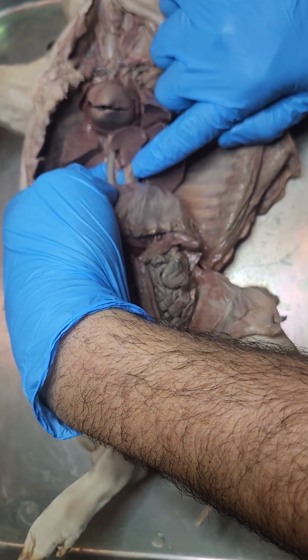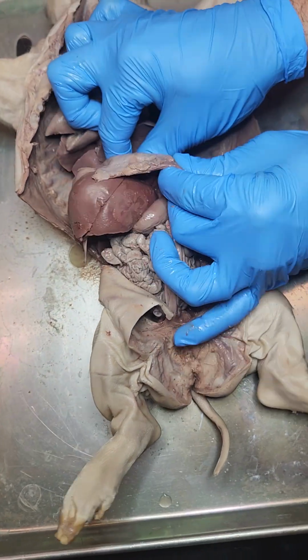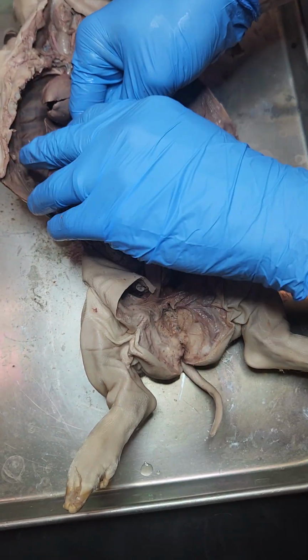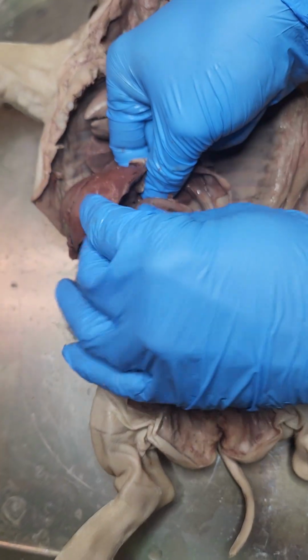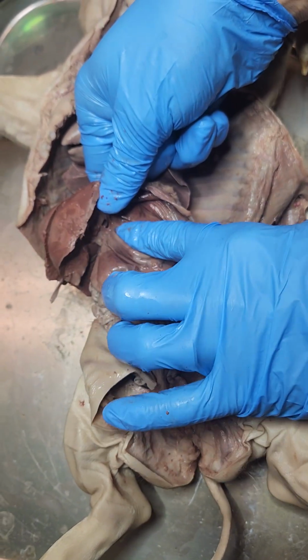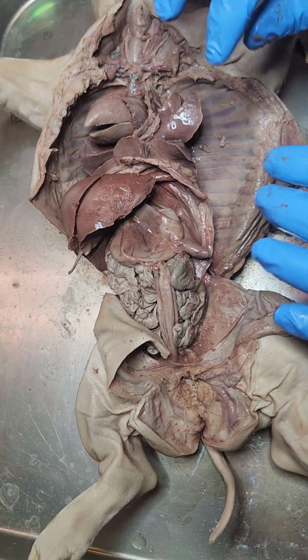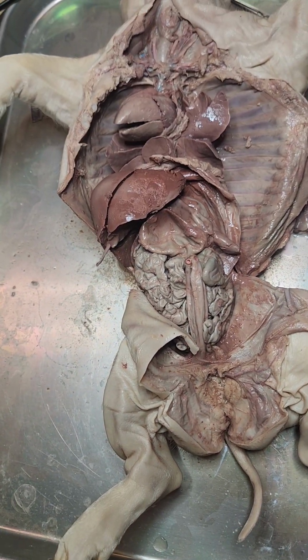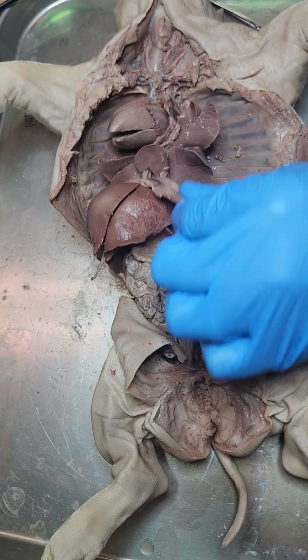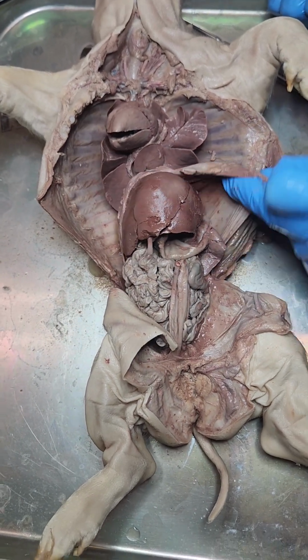that's the esophagus. Is the esophageal sphincter next? It is. So when you follow it down, you can find where it enters the stomach, and it'll go through the diaphragm. And if you put your finger right here, you'll notice that that's a little firmer right there. That's the esophageal sphincter. So it's a muscle that holds the stomach intact. See, diaphragm. Diaphragm's what separates the thorax from the abdomen, so it's right here.